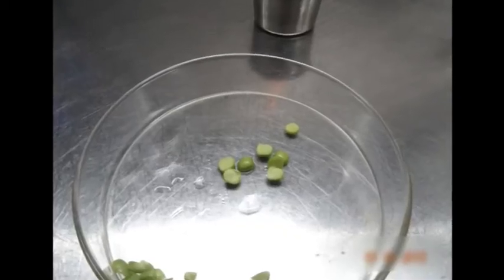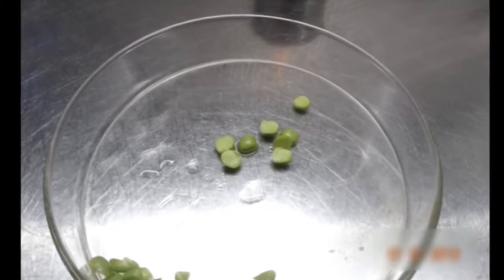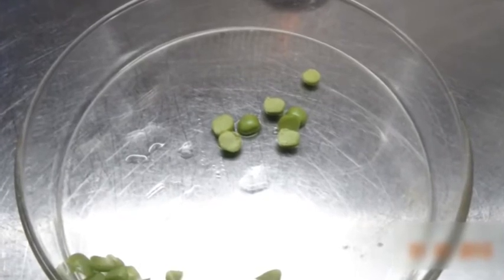Using the sterile forceps, transfer the seeds to a sterile petri dish and peel off the seed coat using a sterile blade. Use the separated cotyledons as explants.